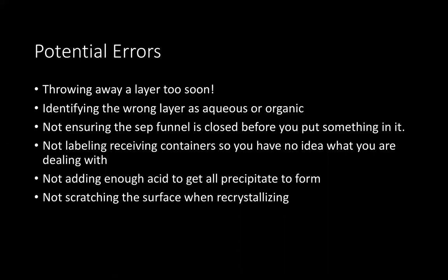Not labeling your receiving containers means you won't know which layer came from which extraction, and it becomes a guessing game. Be careful with your labeling — we have Sharpies in the lab, and writing on glass can easily be removed with water and a little elbow grease, so there's no good reason not to label. Sometimes people don't add enough acid to get all the precipitate to form in the two acid precipitation steps. When recrystallizing, if scratching is needed to help crystals start growing, occasionally people forget to scratch the surface — both of these last two errors yield low recovery results for the products.